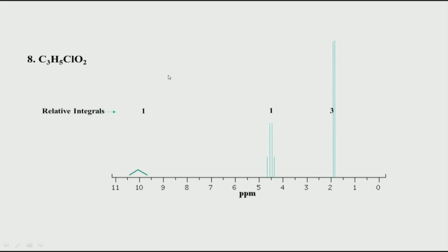Again, here this seems to be the same molecular formula as we saw in the previous slide. That means it is a structural isomer of the compound. In NMR the structural isomer can be distinguished by looking at the J multiplet pattern. With IR spectroscopy it is kind of difficult to figure out whether there is a branched chain, because if the functional groups are the same, IR cannot distinguish so much.